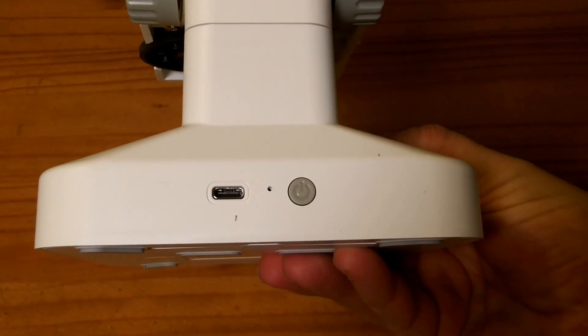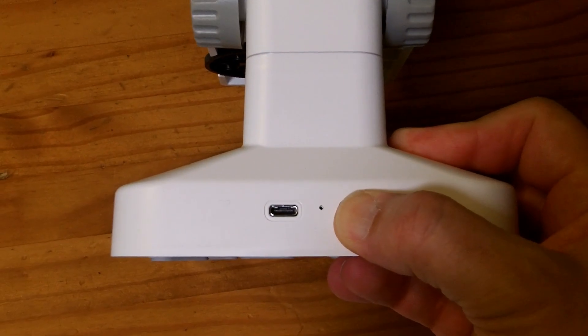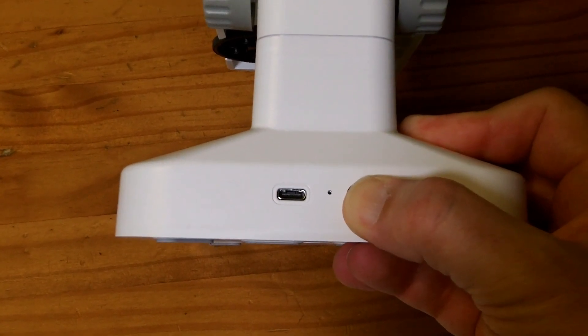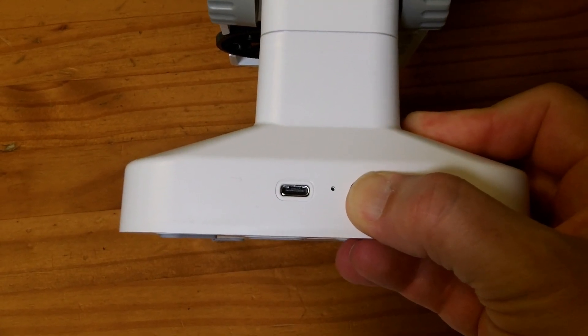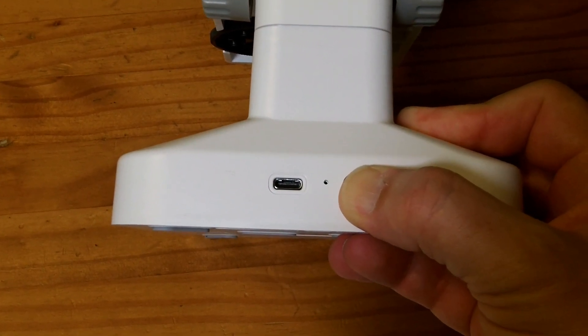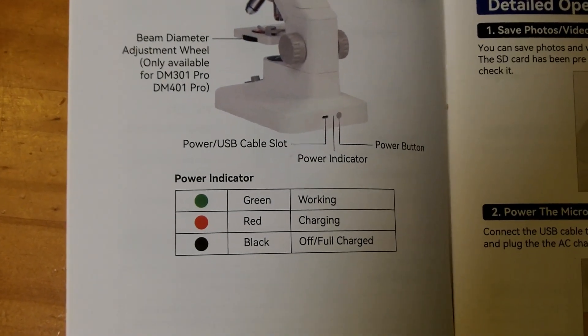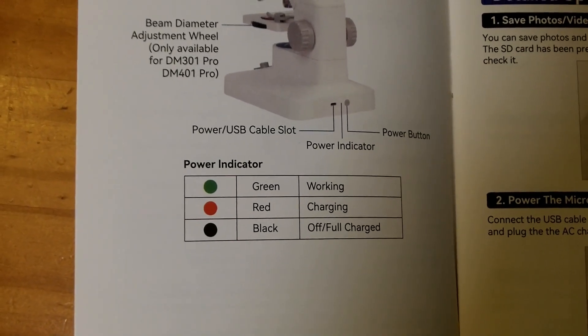It turns on and you just push this power button on the back. I've pushed and held the power button. Despite there being a rechargeable battery inside, it's not turning on. So it looks to me like the battery may be discharged. And it might be that the power switch got pushed on in shipping, but I'm going to plug it in. According to the manual, a green light means it's working. A red light means it's charging the battery. And if it's off, it means it's fully charged or just turned off.